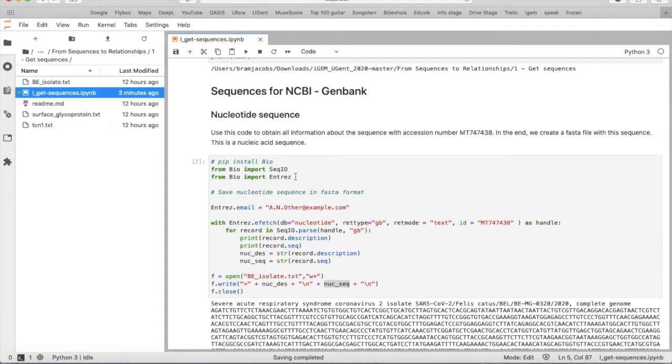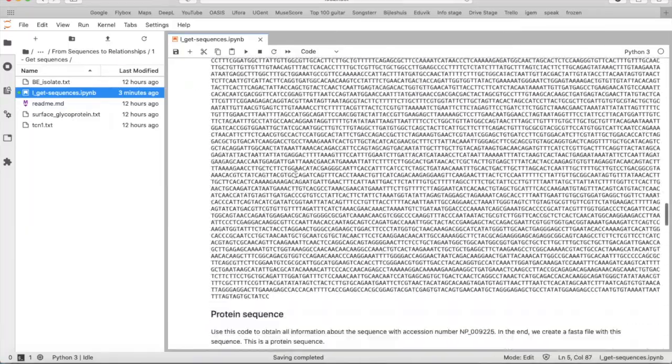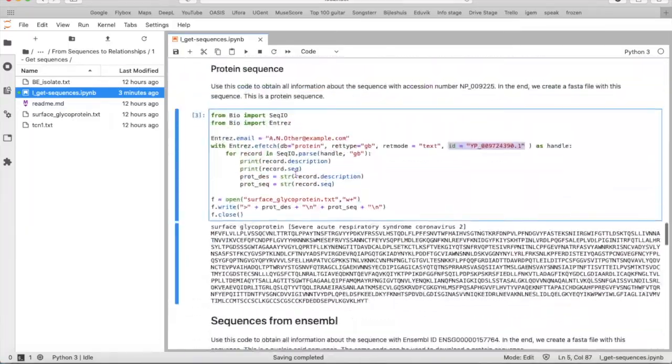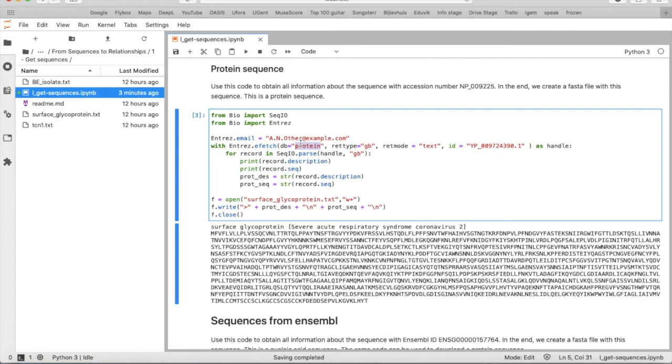So we can do the same for a protein sequence. You use this code, that's exactly the same code as before, only you have to change two things. First of all you have to take an accession number for protein sequence and you have to choose database as protein because you're looking for a protein sequence.